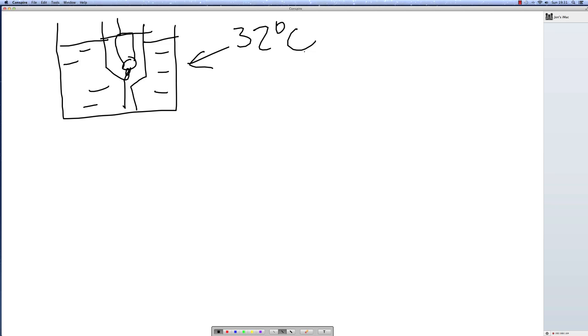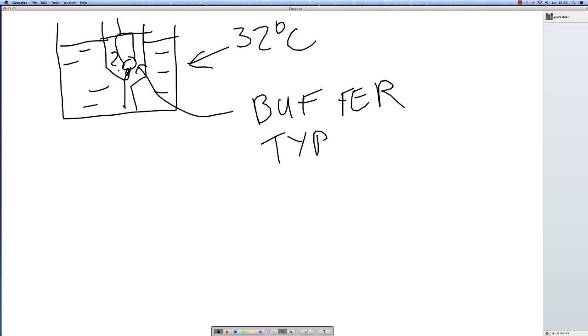What about the tissue itself? The tissue is sitting here inside a liquid. Do you think this liquid is water? No, it isn't. If you put your tissue into water, nothing would happen. So that liquid in with the tissue is something called a buffer. In this case, something called Tyrode's.